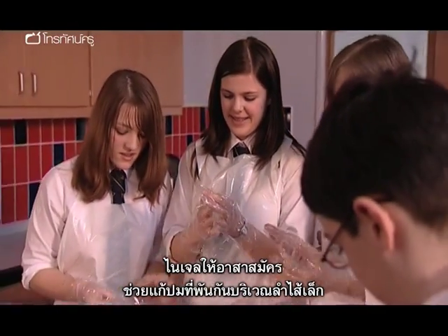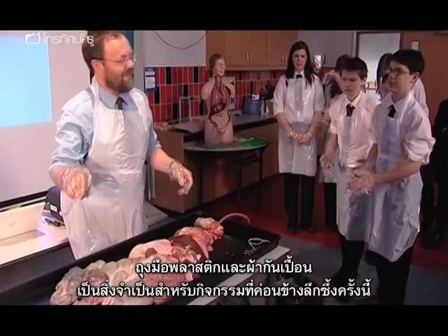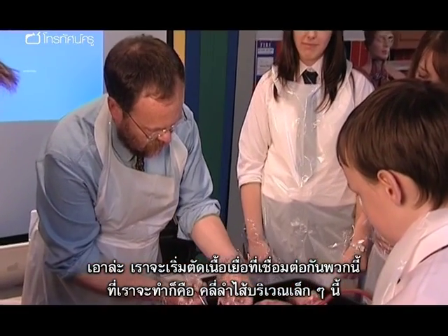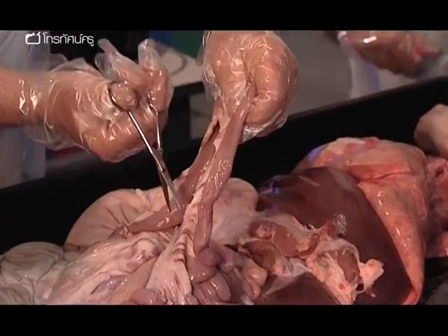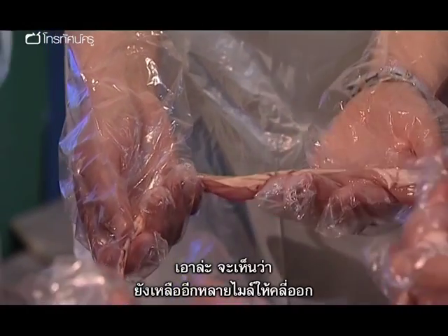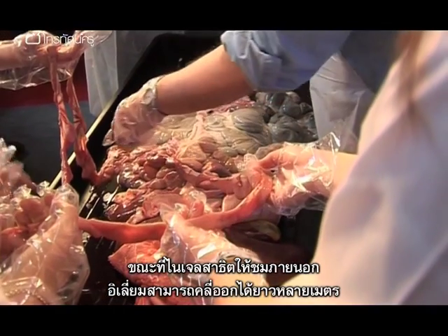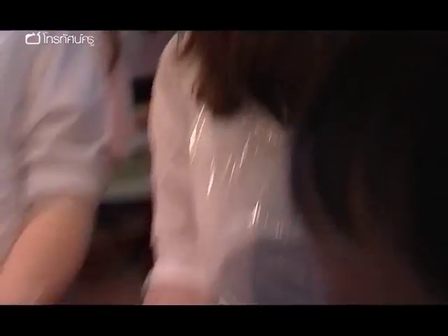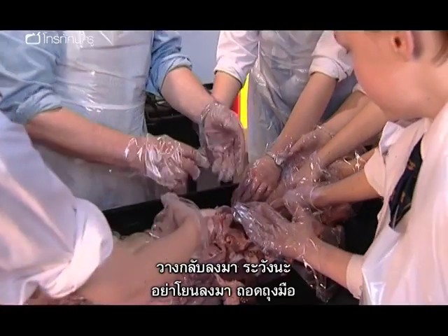Nigel invites volunteers to participate in untangling a section of the small intestine. Plastic gloves and aprons are needed for what is, quite literally, an extension activity. "I'm just going to start cutting this connective tissue. We're going to unravel just this little bit of gut, to show you how very, very complicated it is — incredibly close-packed. Keep your hands over the tray." When done outside, the ileum can be unravelled to several metres in length, but even a slight tear is very unpleasant.